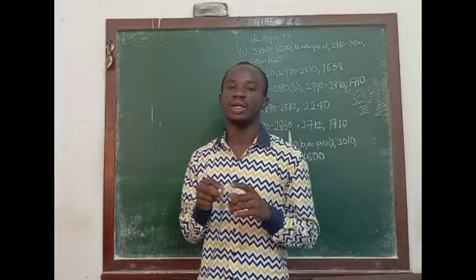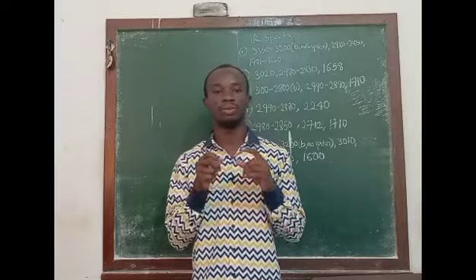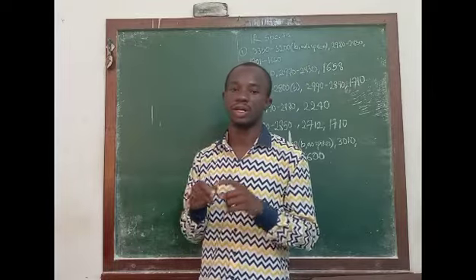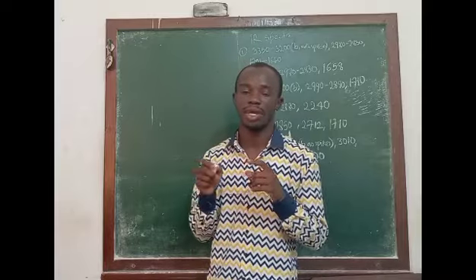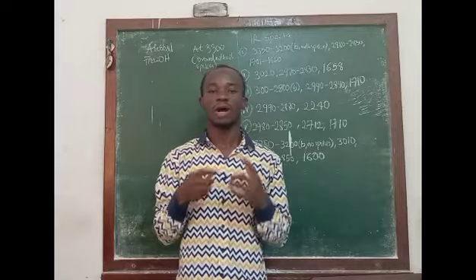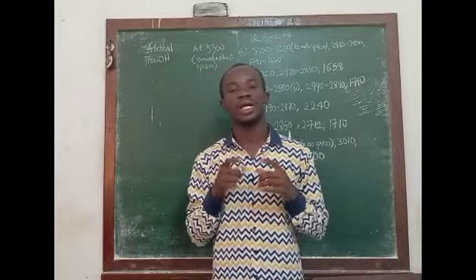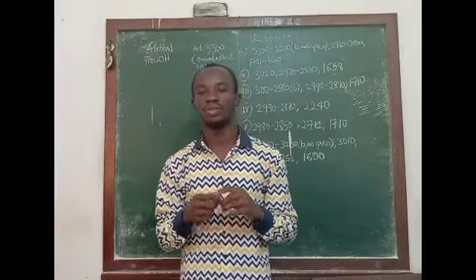If you remember when I was talking about amines, I said one of the signals by which you can identify your amine is the NH2 stretching vibration, which is a broad signal at around 3300 with spikes. But for the free OH functional group, the signal is usually at around that same place, but it's broad without spikes. So when you have a broad signal far above 3000, specifically at 3300, and it's without spikes, it means you're having a free OH functional group in a given compound.